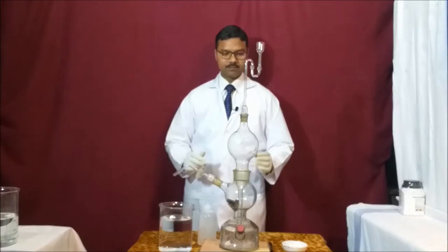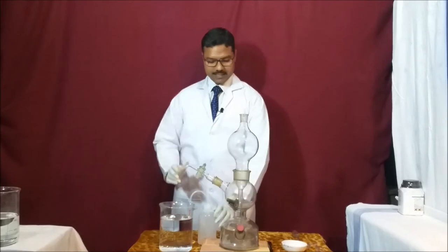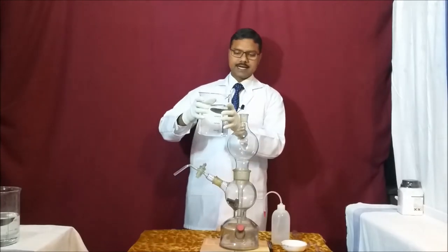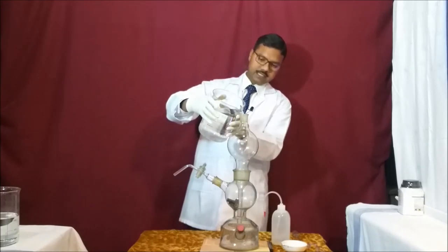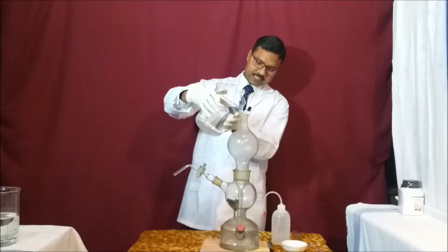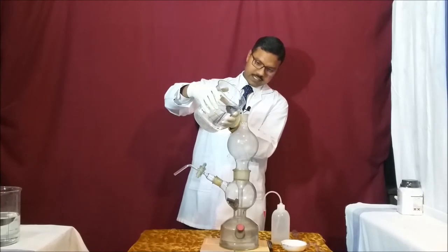Now after fixing the connector, I am taking out the thistle funnel and introducing dilute sulfuric acid through this chamber. You can use a funnel or introduce it directly — I am introducing it directly. You can see our sulfuric acid is going directly from chamber A to chamber C. We have to fill chamber C completely and chamber B halfway with dilute sulfuric acid.